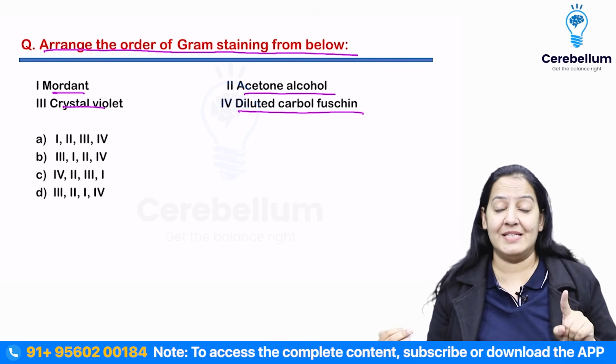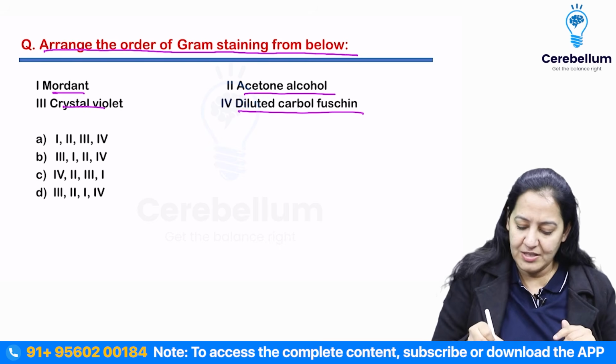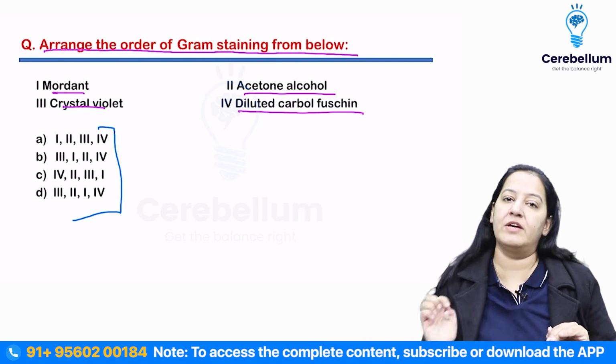I have described the steps of the Gram stain. Can you arrange them in order from first to last? Now let me revise the 4 steps of Gram staining.